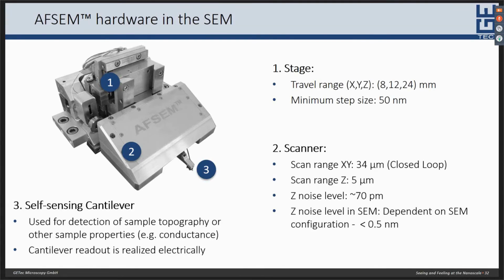Okay, then there were a bunch of questions concerning the cantilevers. One question was, how is the performance of the self-sensing cantilevers compared to optical cantilevers, and how much is the price for such a self-sensing cantilever?